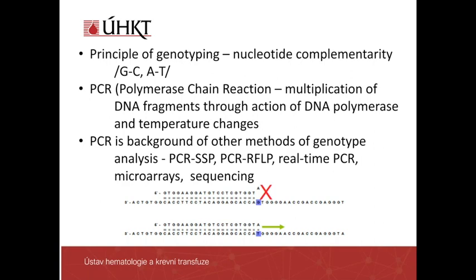Molecular genotyping is a principle based on nucleotide complementarity and the PCR reaction. The final genotype is then analyzed by different methods like PCR-SSP, RFLP, real-time PCR, microarrays, and different sequencing techniques.